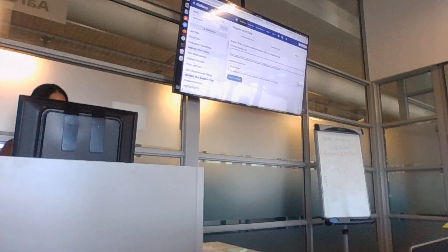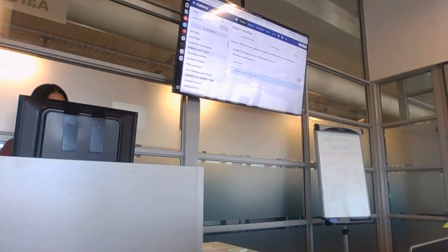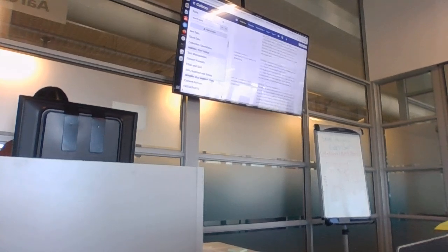If the workflow is not on your desktop, you can go to public servers and you can type in here SARS, for example. There's one for Sandy here somewhere. One that Peter made right at the bottom.